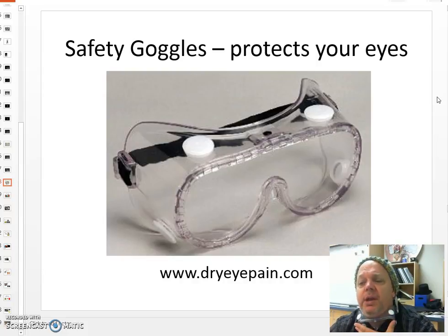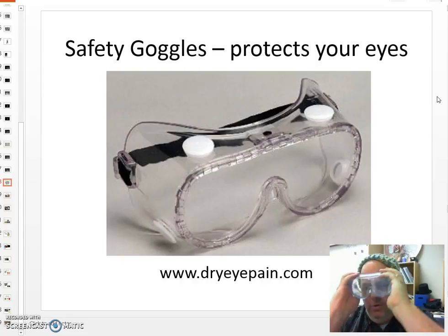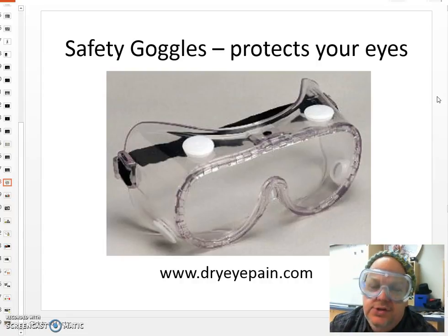The weak spot about this is it's great if you believe that a ninja is after you or a kung fu master, because it will protect your throat from somebody's lucky punch or maybe the kick. That's great. Too bad your eyes get popped out. So again, the correct way to wear the goggles is just like this.